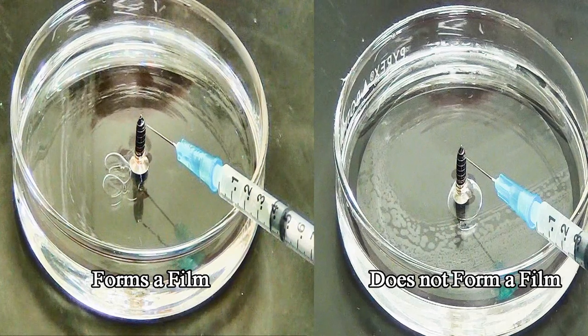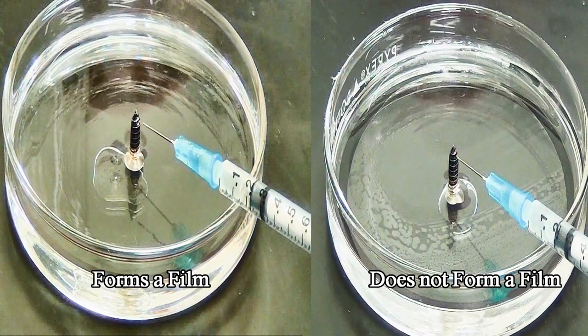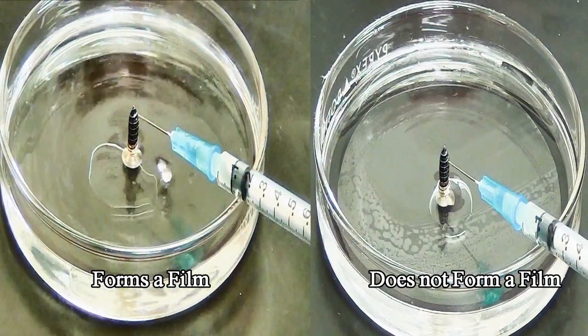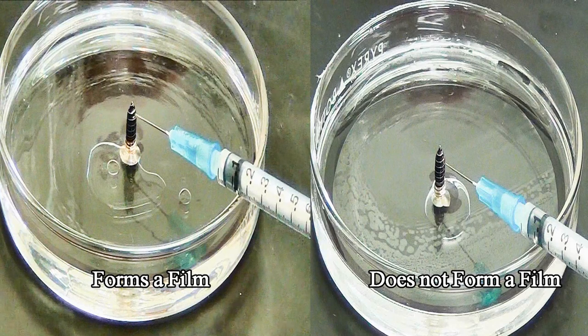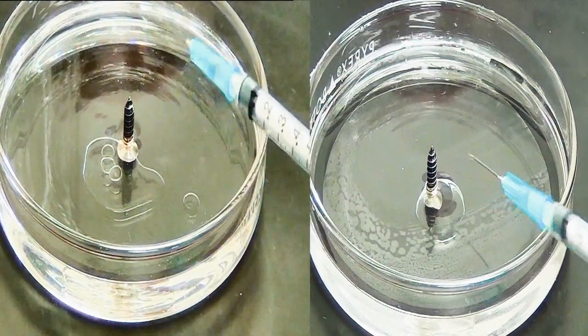In this demo, the fuel is cyclohexane and the screw is used to slowly disperse the foam solution. On the left, the foam solution forms a film, spreading from left to right across the dish very quickly, forming a barrier that protects the fuel from ignition. On the right, the foam solution does not form this film and leaves the fuel exposed.